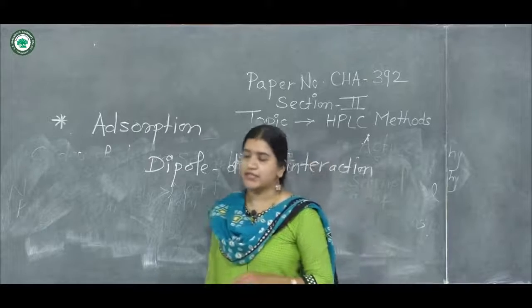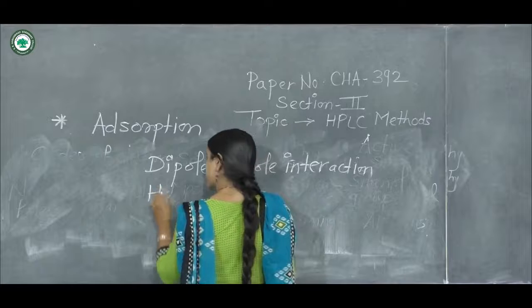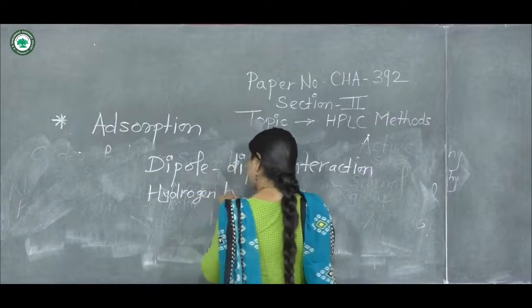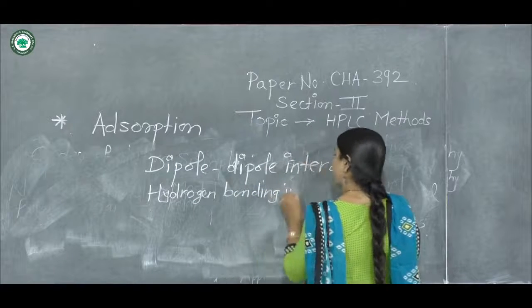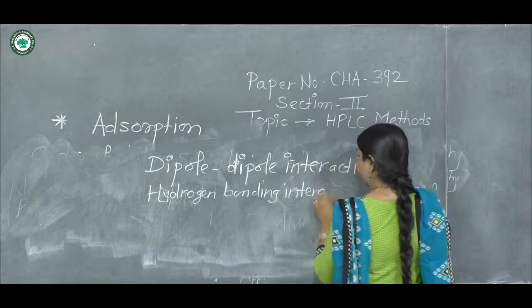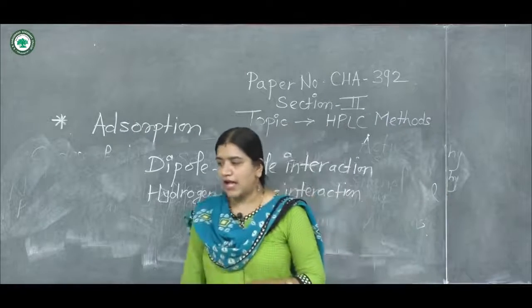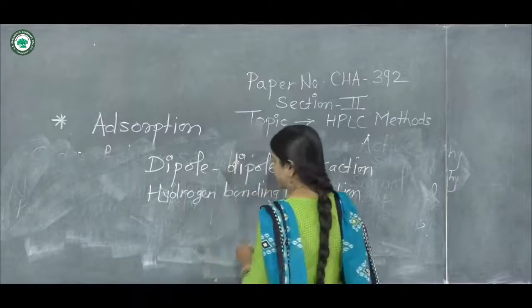The second one is the hydrogen bonding interaction. And the third one is the pi complex bonding interaction.